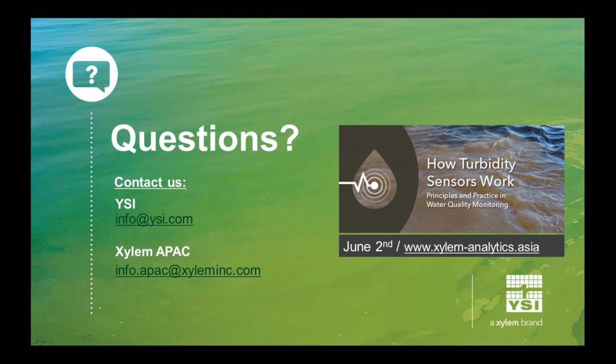I have been working with harmful algal blooms for many, many years, and I have seen Microcystis blooms, and I've collected the algae and taken them to the lab, and they weren't making even the tiniest bit of the toxin. So just because you have the algae there does not mean you have the toxin. And that's why all algae monitoring tools need to be paired with the other analyses that are important to you.